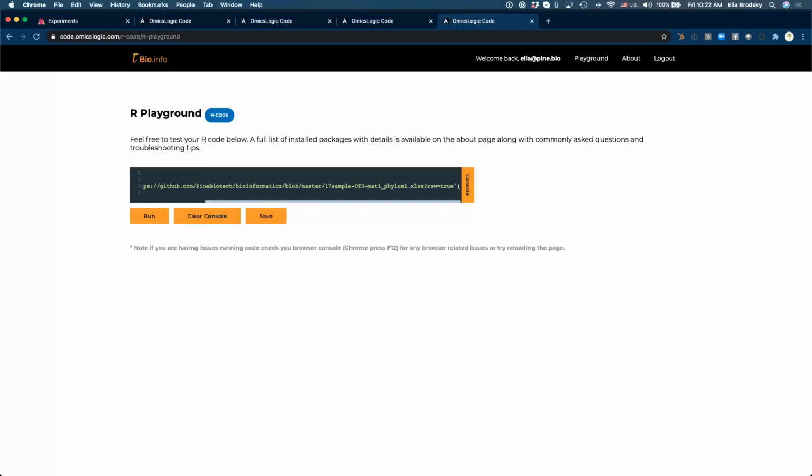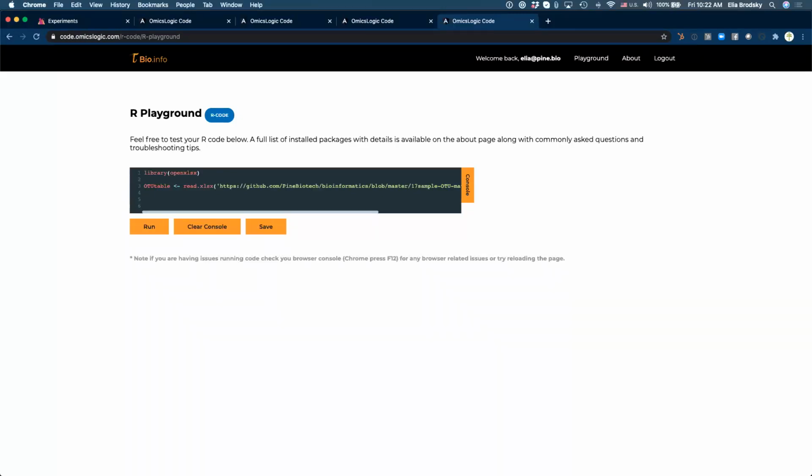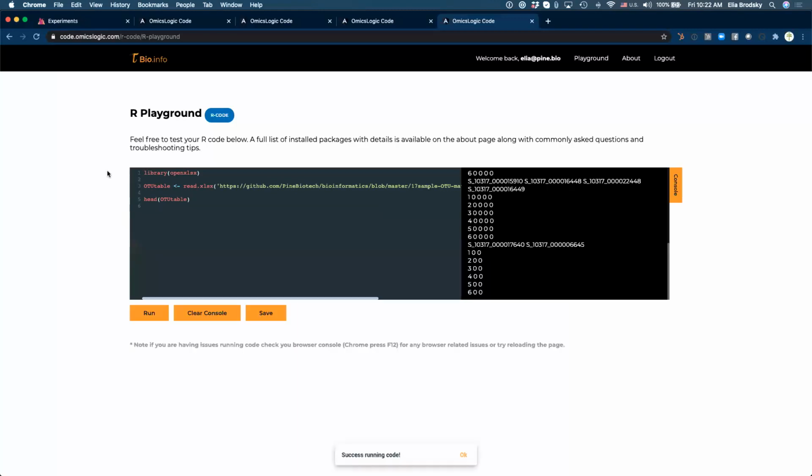We need sheet number 2, which is where the actual data is stored. Okay, let's see that we got it. OTU table. All right, success running code. Zoom in.